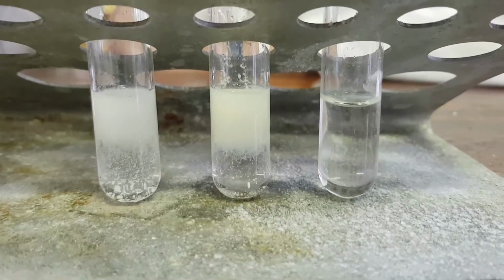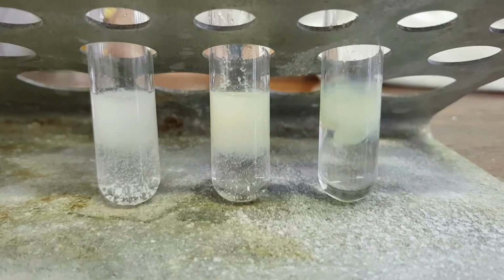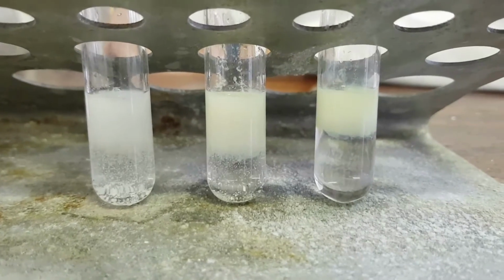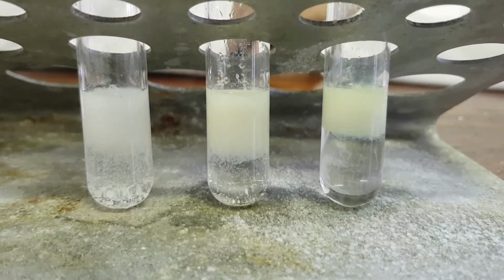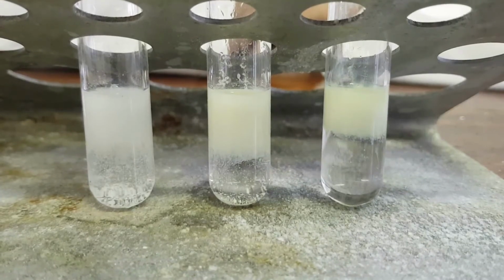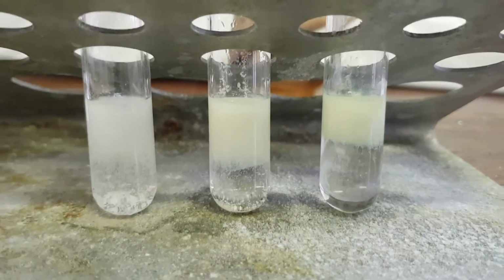Now for the iodide on the right. Well, this time there's no mistaking the fact that that is a yellow colour. And so what we see there is adding the silver nitrate solution to the chloride gives us a white precipitate, to the bromide gives us a cream precipitate, to the iodide gives us a yellow precipitate.